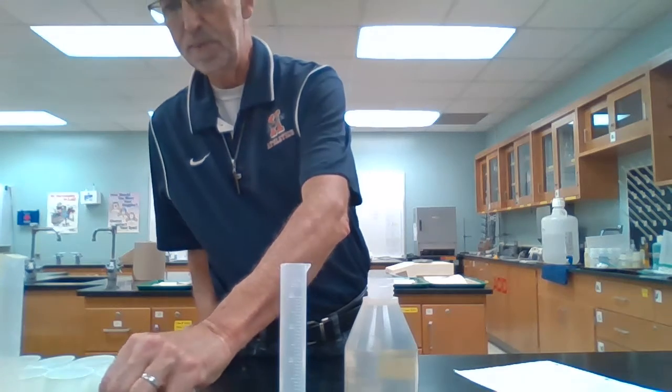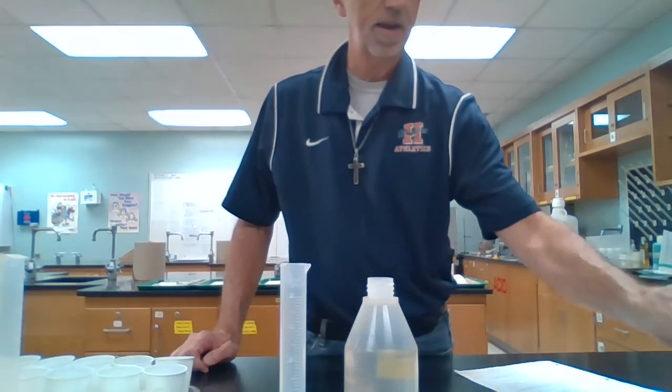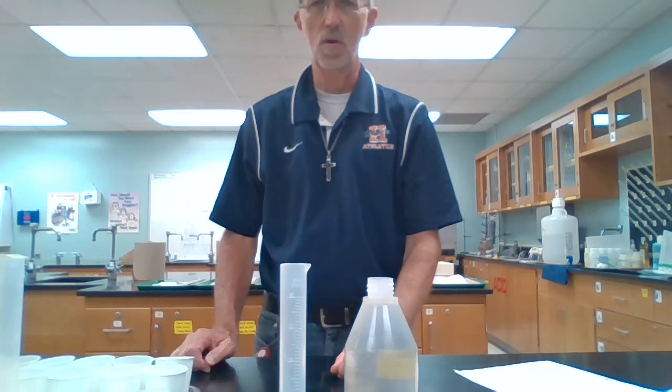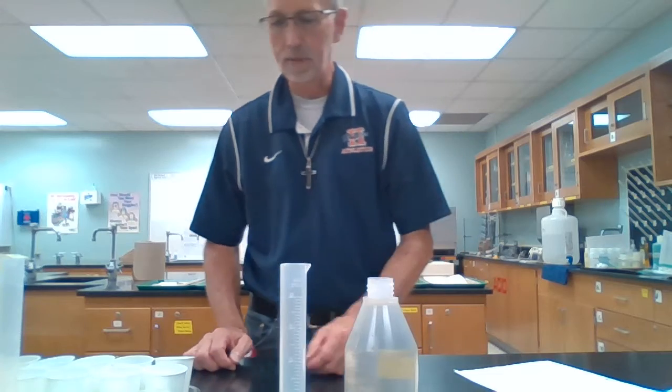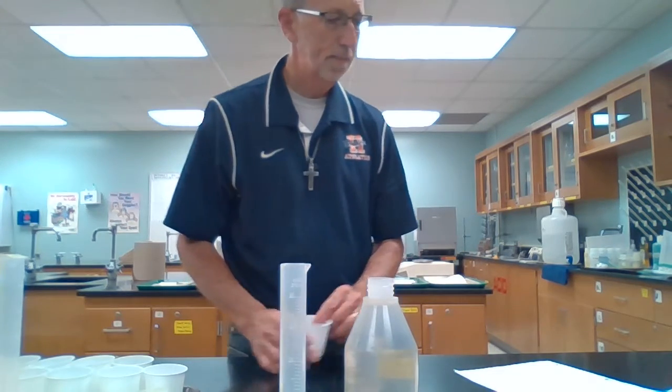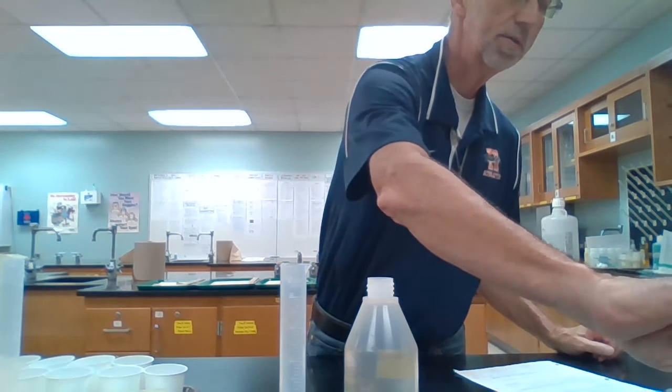Since some of these are pieces, I'm going to put a container here so the pieces don't go everywhere. So I'll zero out the balance. There we go. All right, so copper sample 1. So we're on line 1, mass of copper. I'll pour those in there.